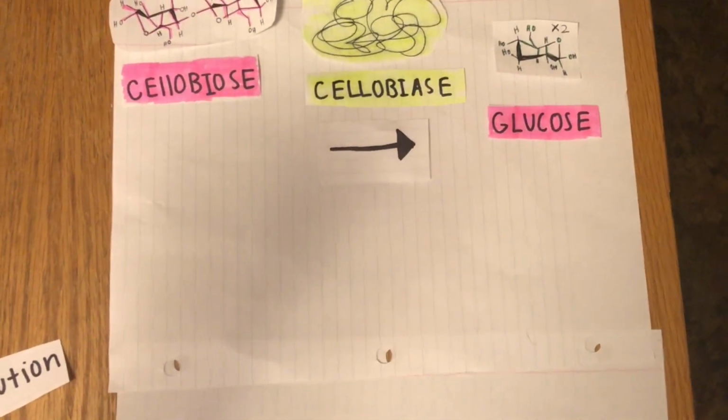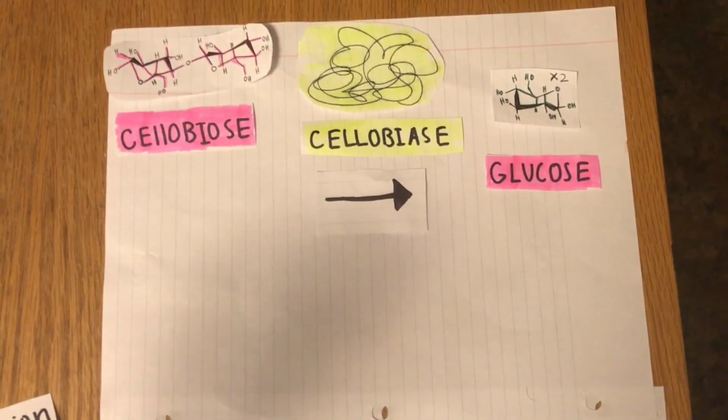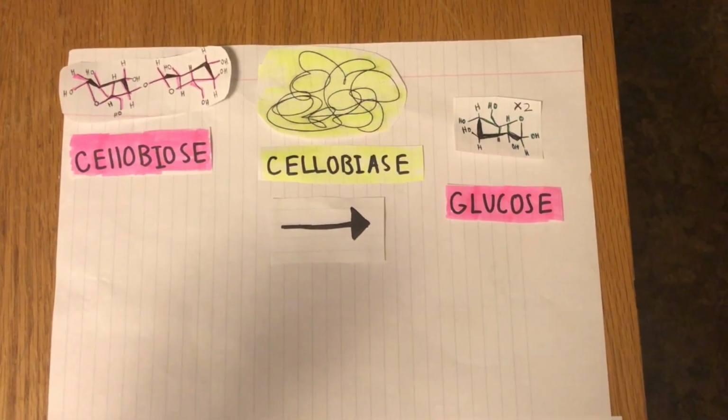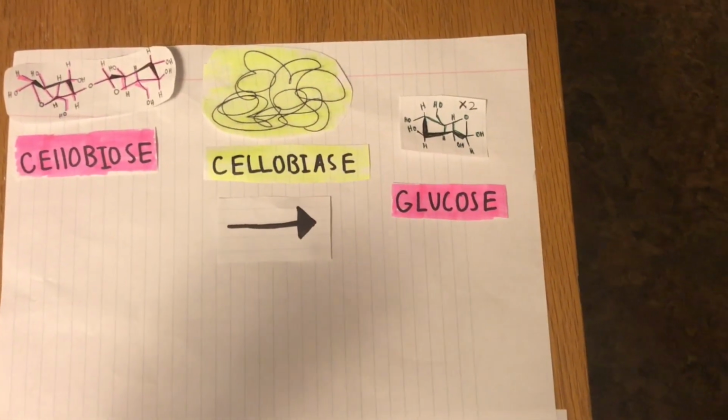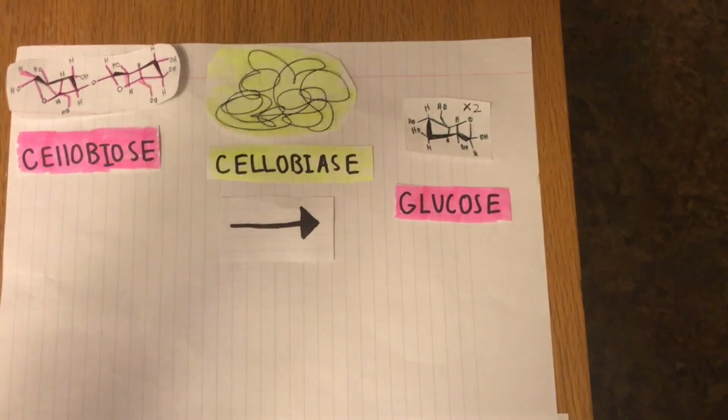We learned previously that cellobiose, a disaccharide, is broken down into two glucose molecules by cellobiase. But how do we study the activity of cellobiase? We study the activity of cellobiase, specifically the kinetic activity of cellobiase, using a Cellobiase assay.